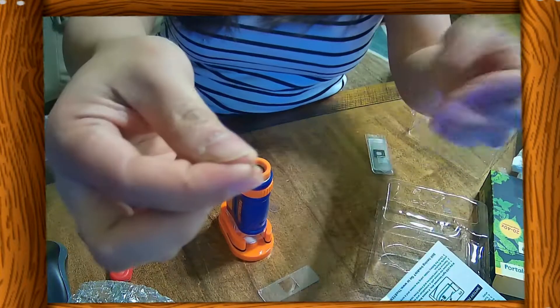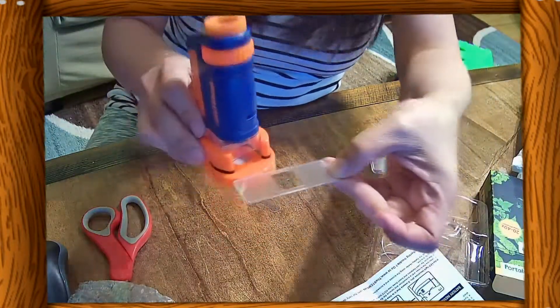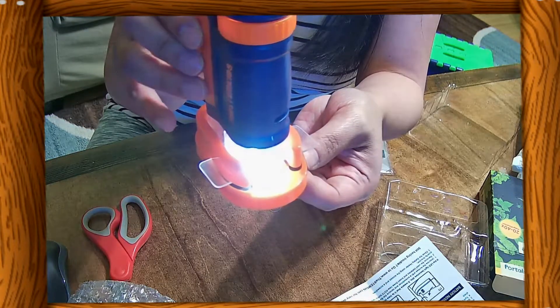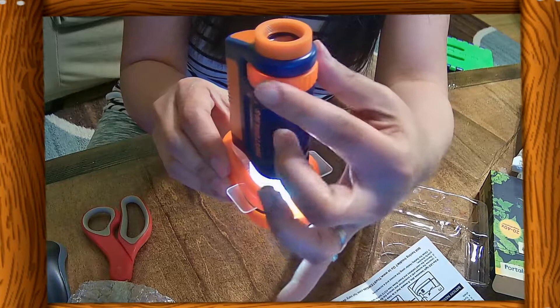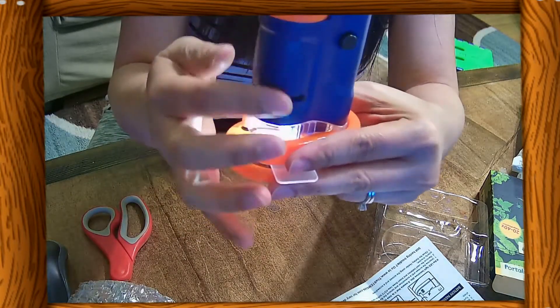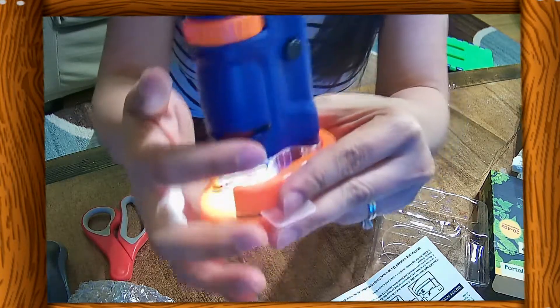Using it with the specimen stage means you are placing a specimen onto the microscope slide. Here's how I grab an item and place it onto the microscope slide and put it into the specimen stage. I press the light button to see the specimen clearly and slide the zoom slider to adjust the magnification. Then I turn the focusing wheel until the image is clear and sharp.